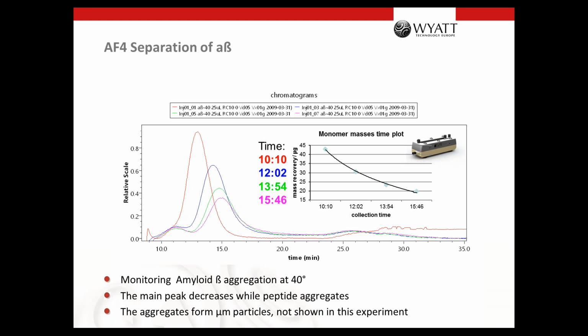Also, it seems that they are better for organic FFF. And then we have some special membranes with a very low cutoff, but this has to be asked in our development department.